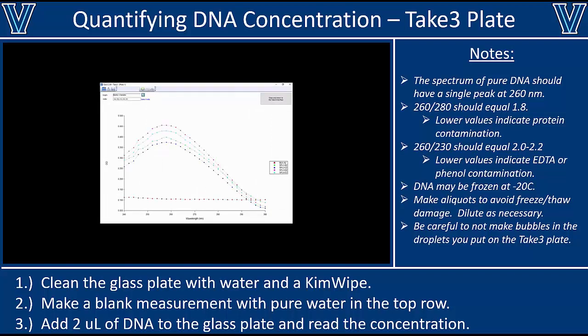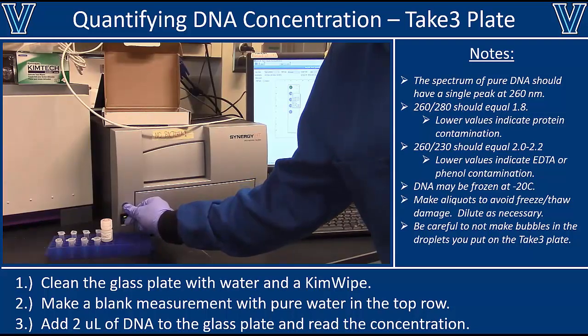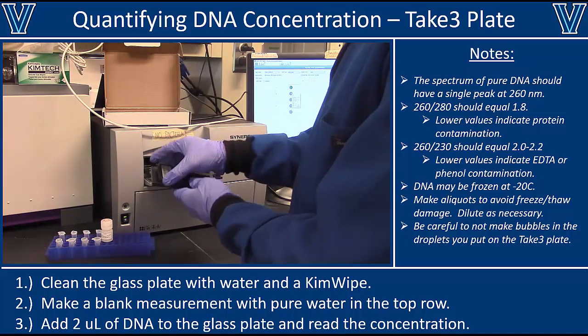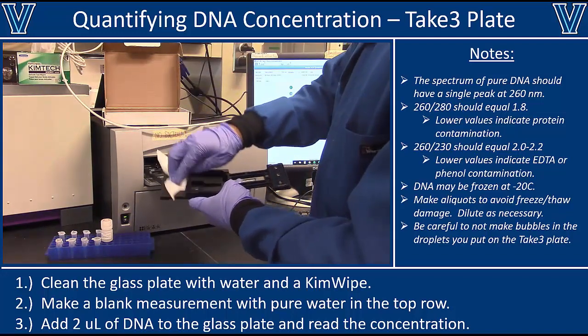So a good spectrum for DNA looks something like this. There's a nice, well-defined peak around 260 nanometers. Then you can close that and go back to the sample layout. If you mouse over one of the wells, you'll be able to see the concentration in each well in nanograms per microliter. You can also see the purity as a 260 over 280 ratio, which should be around 1.8 to 2.